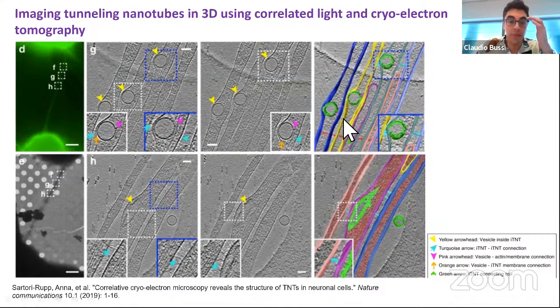Entonces, nuevamente, a partir de estas observaciones, uno puede empezar a preguntarse, bueno, ¿cuál es la composición de estas vesículas? ¿Cuál es el rol de estas vesículas? Hay condiciones en donde quizás esto se genere más o se genere menos, etcétera. Son un montón de preguntas que surgen únicamente si uno tiene la posibilidad de poder observar la ultraestructura.